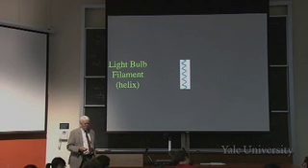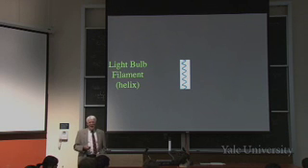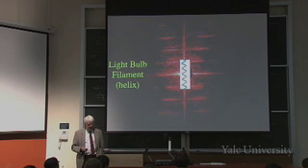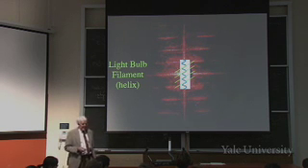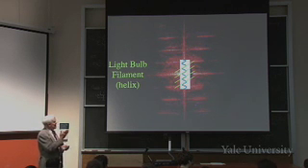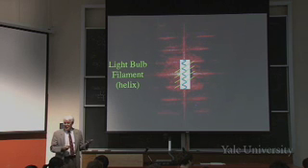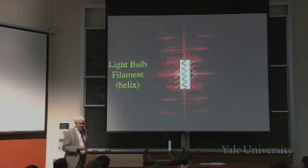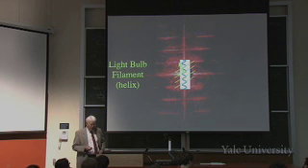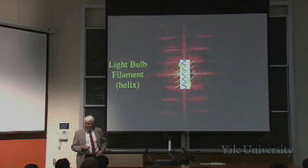Okay, now let's look at the light bulb filament, the last thing we looked at, and see why the scattering from that looks the way it does, like this X with dots along it. We want to find if there are electrons on this helix. We can find a set of evenly spaced parallel planes like the yellow ones here. So we'll get scattering perpendicular to those planes, and sure enough, there it is, that spot. But it goes not only up but also down, both branches. Both directions of that particular branch of the X come from the same planes.